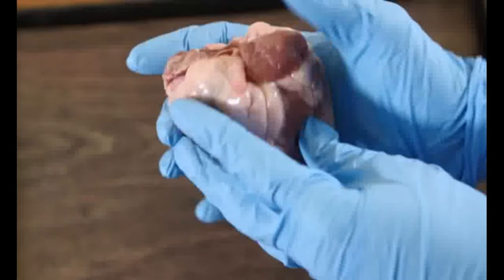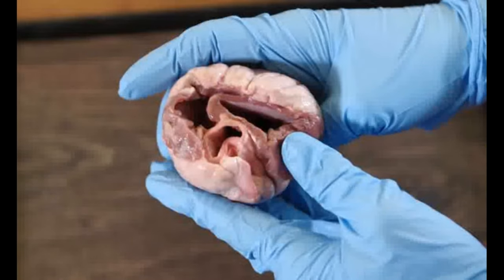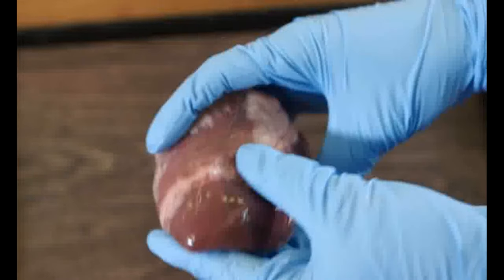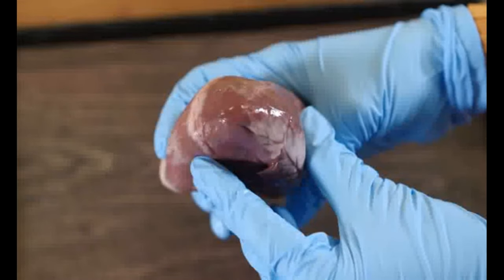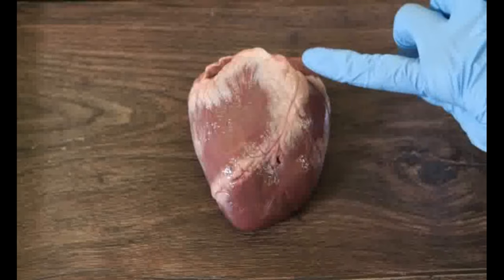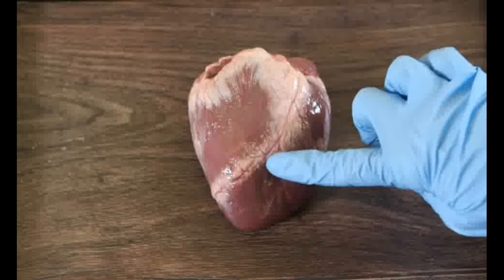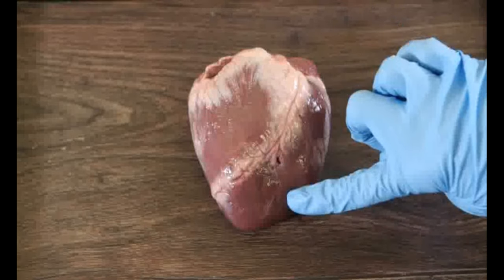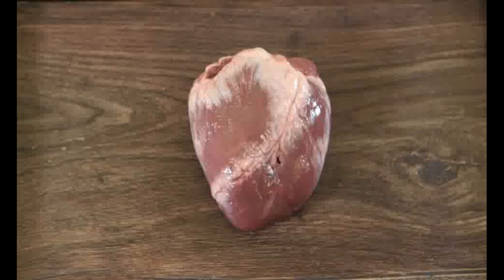This is the top of the heart. The vessels have been cut away. This is the apex of the heart. These are the coronary arteries. These special arteries bring oxygenated blood to the outer layers of the heart wall. The heart muscle has its own oxygen supply because it needs lots of energy to contract.